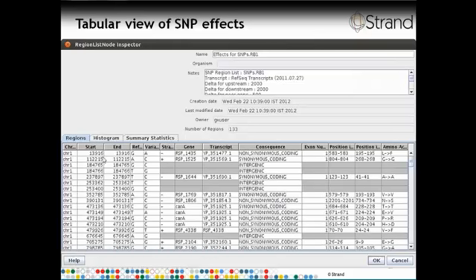What it indeed shows is that the organism has a very high GC content. It actually has a 70% GC content. So naturally, whatever mutations are happening are resulting in a larger number of C's and G's. So this kind of analysis is possible through the region list operations.